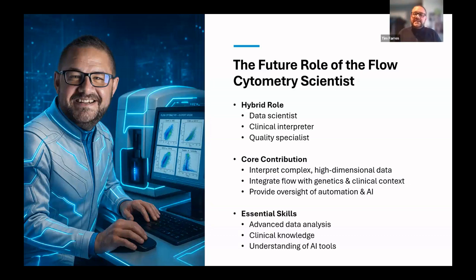As I said, we're no longer just technical operators. We're increasingly functioning as data scientists. We're managing and interpreting high dimensional data sets generated by very advanced platforms. At the same time, our role as clinical interpreters is expanding. We're expected to contextualize immunophenotypic findings alongside morphology and clinical information. And this may also help interpret genetic findings, thus contributing directly to the diagnostic and monitoring decisions within multidisciplinary teams.